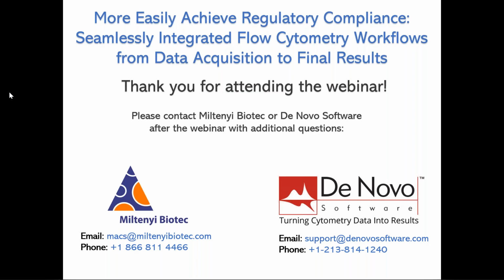But of course, FCS Express will read FCS files or MQD files. So if you're halfway through your project and you want to get started in FCS Express and you have FCS files, don't worry. If you've already converted them from MQD to FCS, we'll read them. FCS Express will also generally convert just about any file type to another. So if you've loaded MQD files into FCS Express and then decided you need an FCS file out of that, there are tools in FCS Express to export an MQD file as an FCS file.